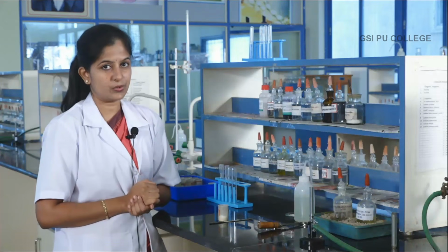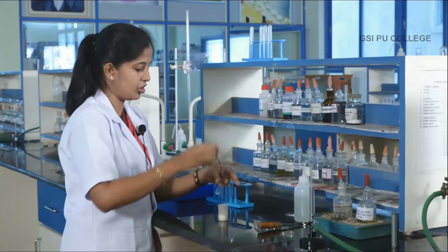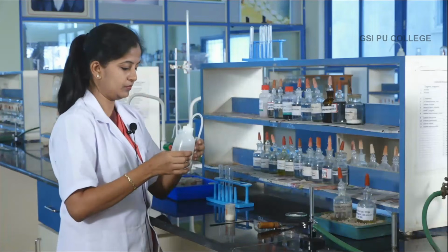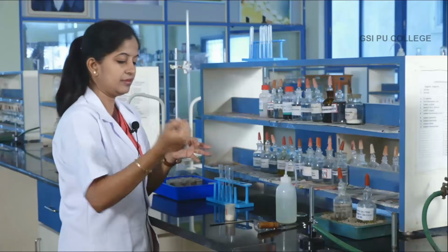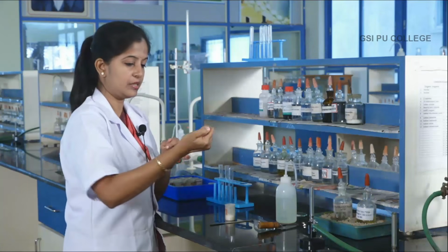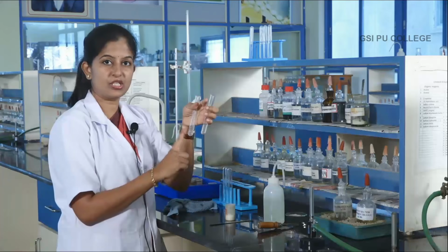For the brown ring test, first you have to prepare a salt solution. Since the given salt is soluble in water, you have to prepare the salt solution with water. So, take a test tube, add a pinch of salt, add water, plain distilled water. Prepare your original solution. In one test tube, your salt solution is prepared.